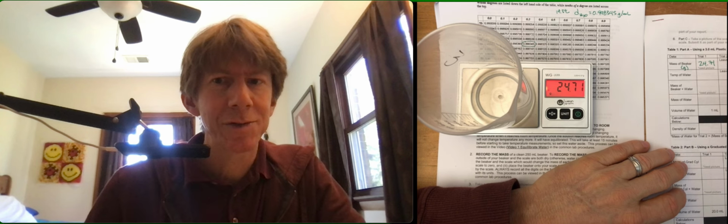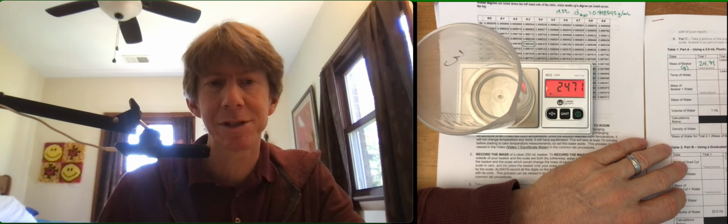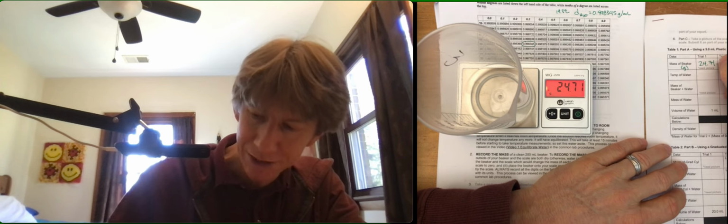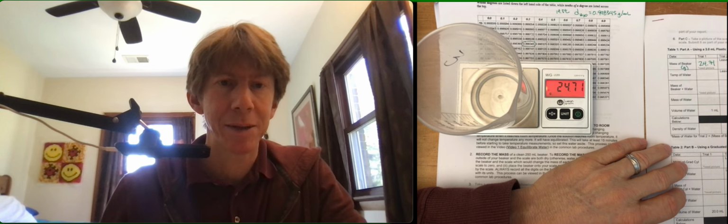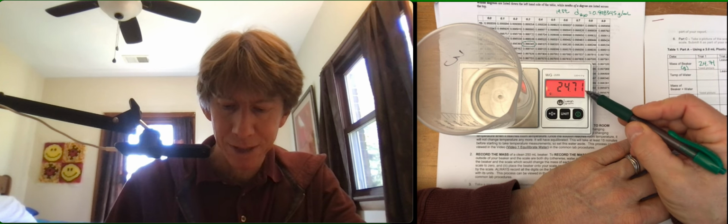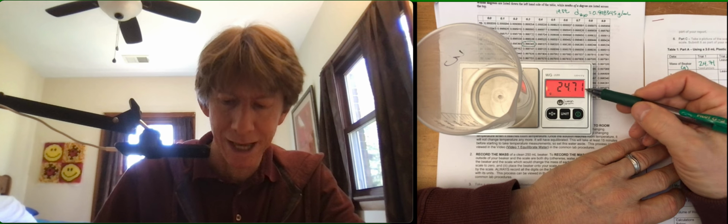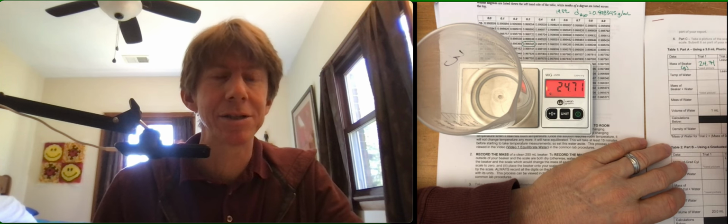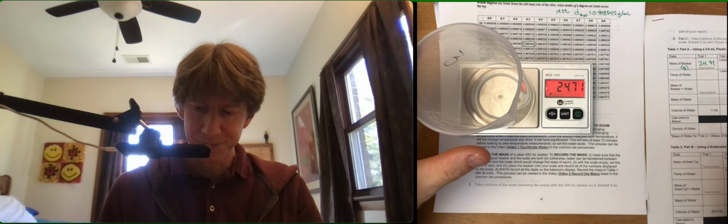If your scale goes from 24.71 to 24.70, that's okay. If it stays at 24.70, you can single cross out your number and then write the new number. But these scales are only accurate to plus or minus about 0.04 grams. So it's in this last decimal place that there's some uncertainty. So let's see. So that's good.